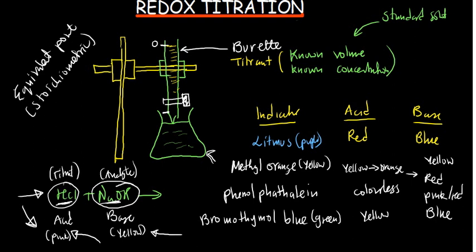Now, mostly you're not going to be advised to use sodium hydroxide as a titrant. You'll not be advised to put your sodium hydroxide there. The question is why?